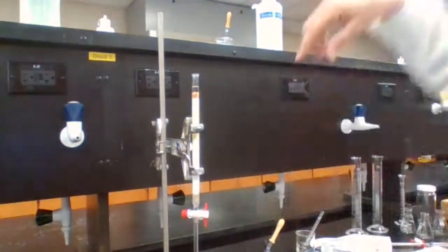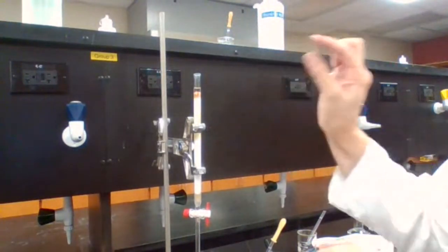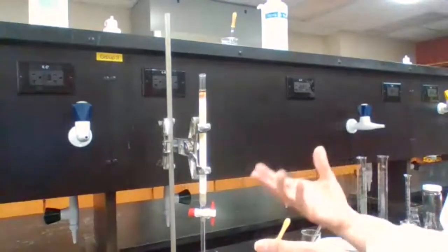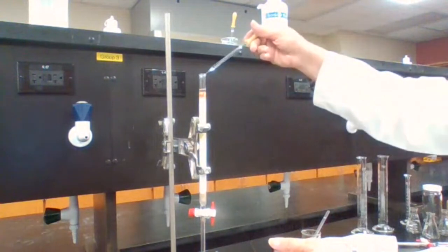Because this is polar, it's going to make this part move faster, and then you get a more specific line, a darker yellow color and a more evened off layer.